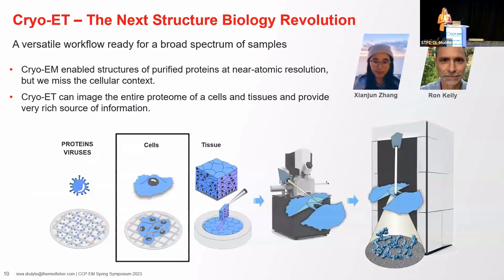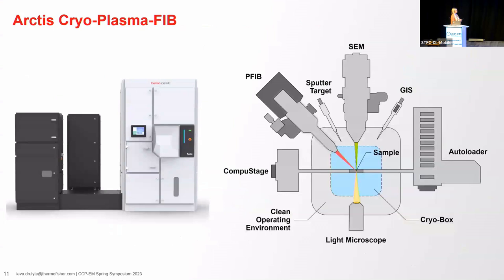With that in mind, now I'd like to show you some of the work that was done by Shanjun and Ron Kelly from Abby's group. The work that I will be showing next was done using the Arctis cryo-plasma FIB.